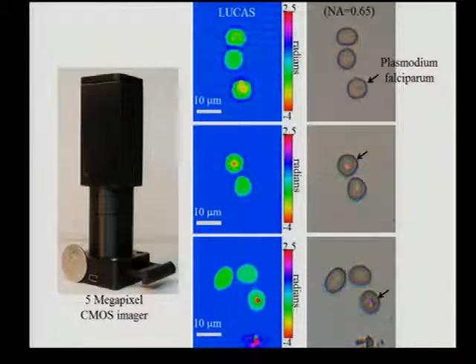This is about 150 grams, this initial design. Again, this is not a very competitive one because it's using an old sensor. It's a 5 megapixel, 2.2 micron sensor. But it still is pretty nice for looking at, in the phase reconstruction channel, malaria infection. This is a red blood cell, and these are plasmodium falciparum that is stained, that gives a stain to kind of give you contrast in the phase channel.